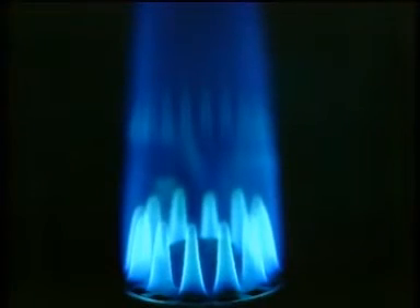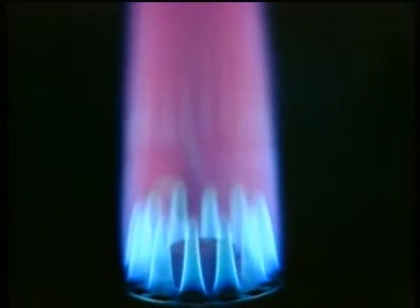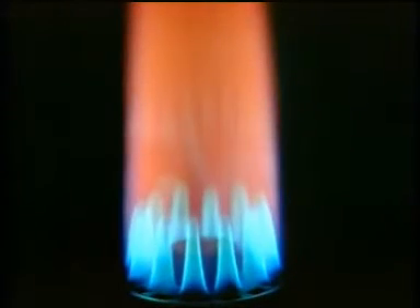The presence of elements such as the alkali metals colours the flame. This is the colour produced by potassium. And this, that of sodium.